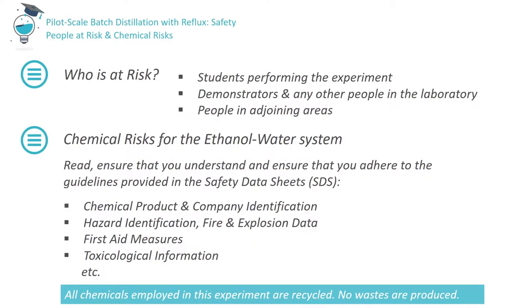Students performing the experiment, the demonstrator and any other persons in the laboratory are all at risk. Remember that people in areas adjoining the laboratory may also be at risk in the event of a major incident. The experiment involves the use of two chemicals: ethanol and water. Copies of chemical risk assessments and safety data sheets are provided and must be read prior to undertaking the experiment. If you have any related queries, consult the laboratory demonstrator in advance.